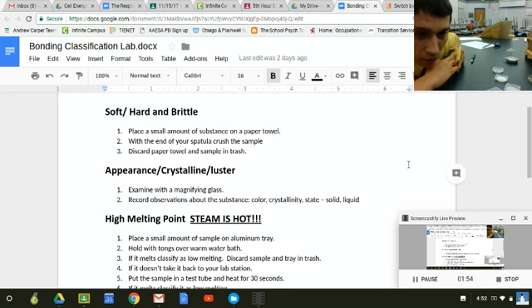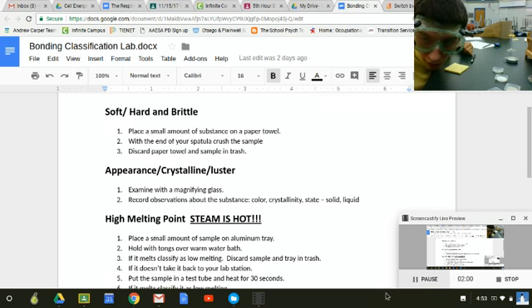So at this point, I'm going to assume I have done all these other steps. I'm going to get my goggles. Okay, I got my goggles from the cabinet. Now I can begin. The first test that you're going to do today is to place a soft, hard, and brittle. Now, let me say you can do any of these tests in any order.